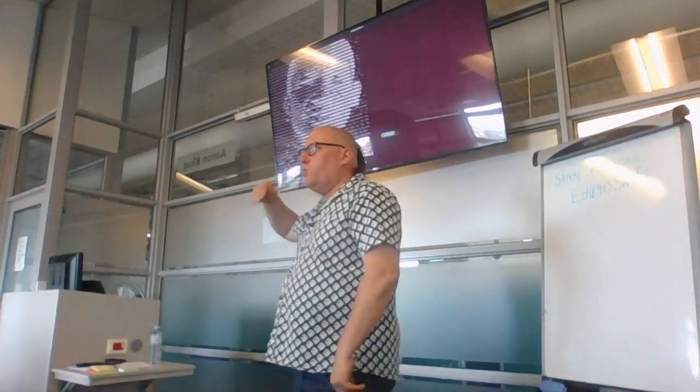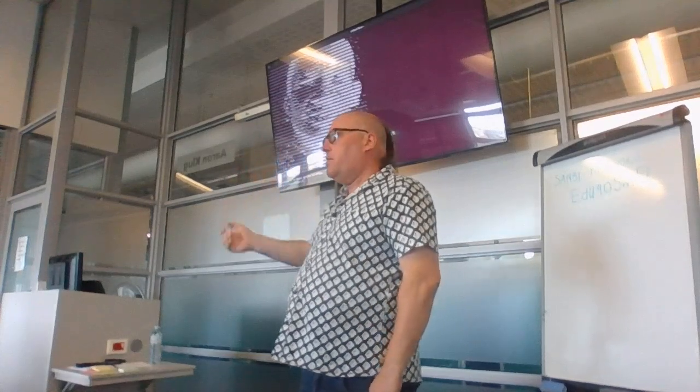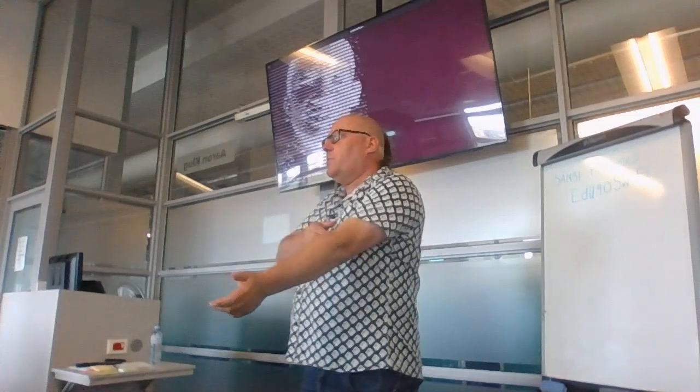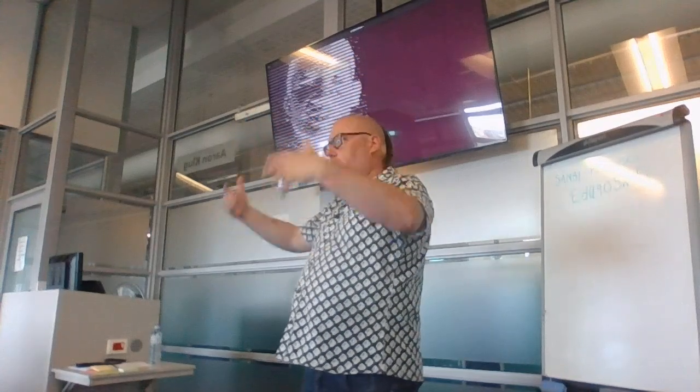But if you are a developer, you can expand Terra with all sorts of things because you can write your own workflows. And it has the advantage that it's well optimized for loading up a whole lot of samples and running them all like that.